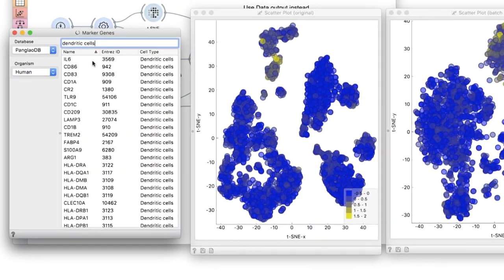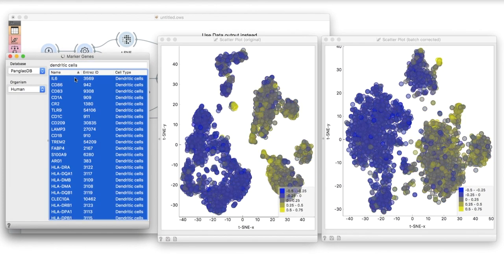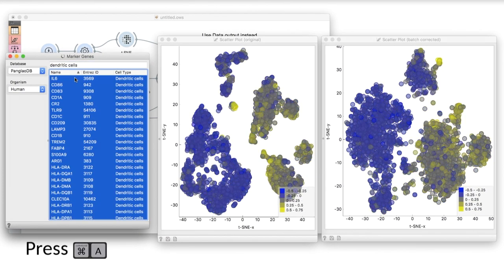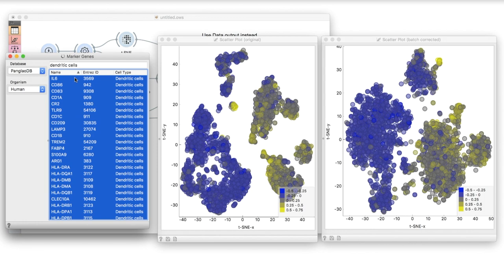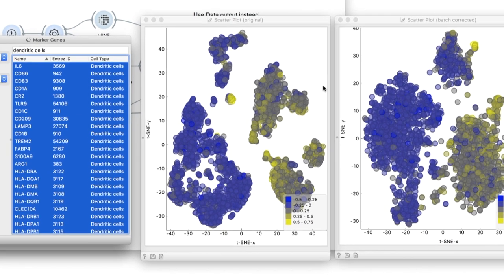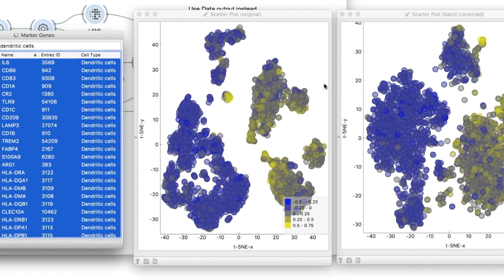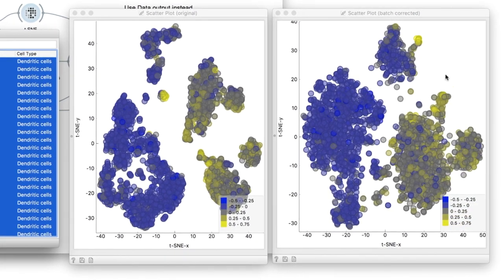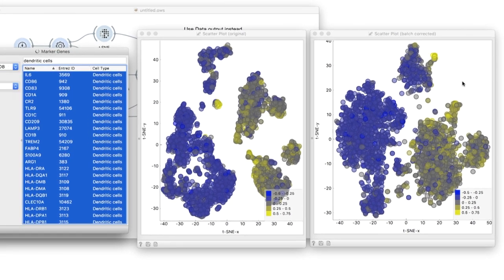Let's take dendritic cells and select all their markers. In the original T-SNE, we can clearly see the dendritic cells form two clusters, one for each data set. In the batch corrected T-SNE, the dendritic cells correctly form a single group.